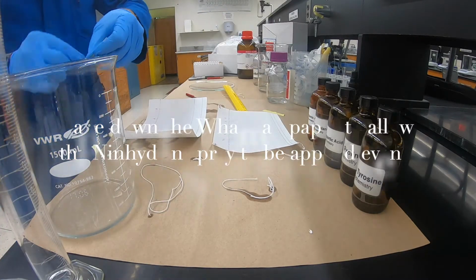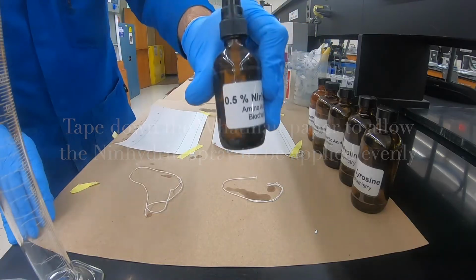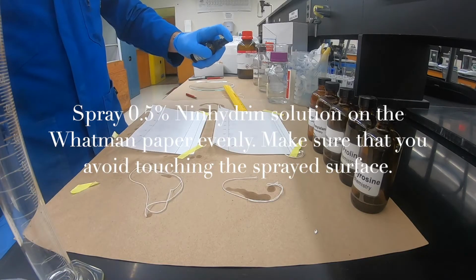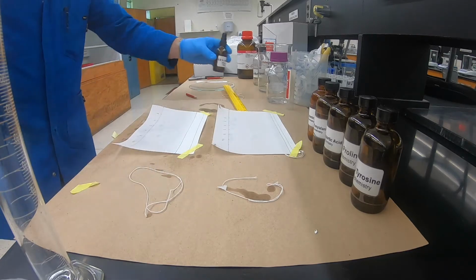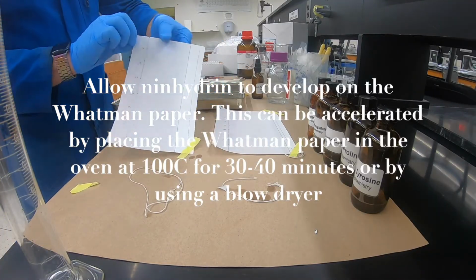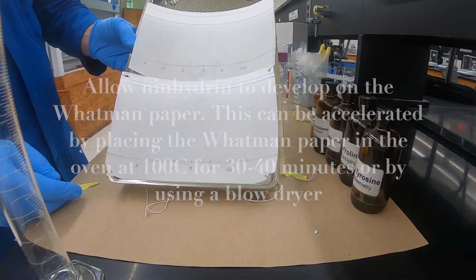You're going to want to tape down the Whatman paper TLCs to apply the ninhydrin evenly. You're going to spray a 0.5% solution over the Whatman paper evenly and make sure that you do not touch the sprayed surface. You can allow the ninhydrin to develop on the Whatman paper by leaving it, or you can heat it in an oven at 100 degrees Celsius for 30 to 40 minutes, or use a blow dryer.